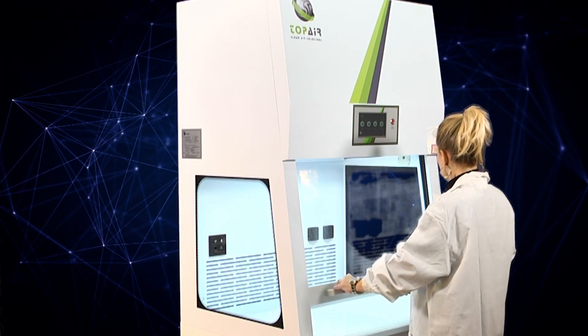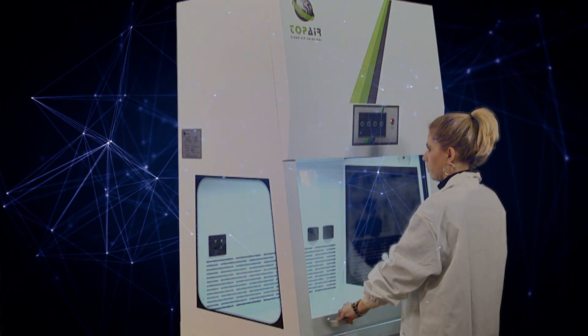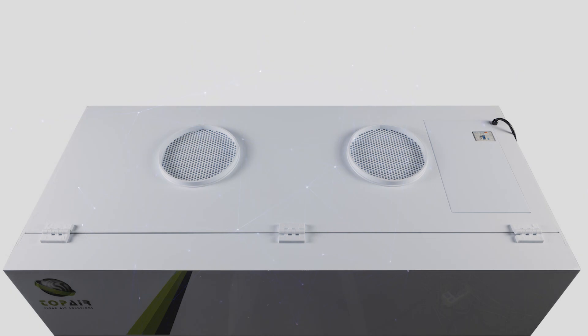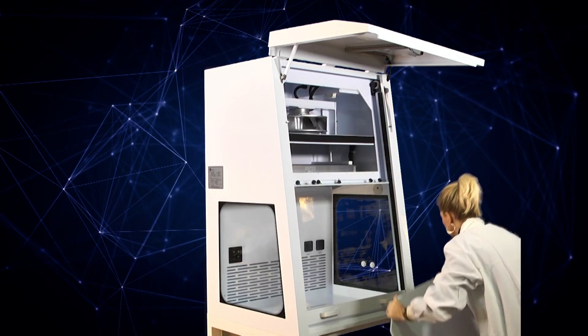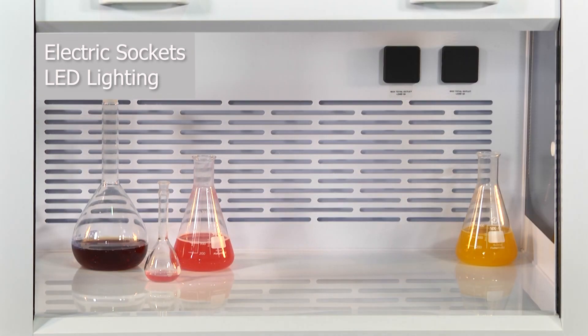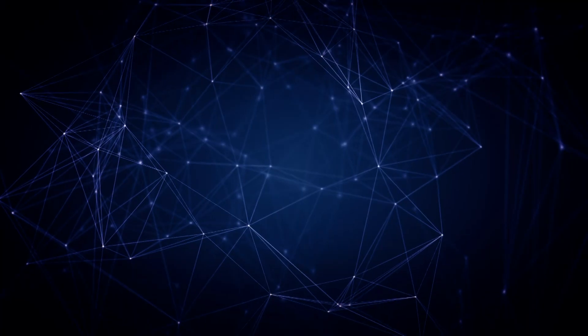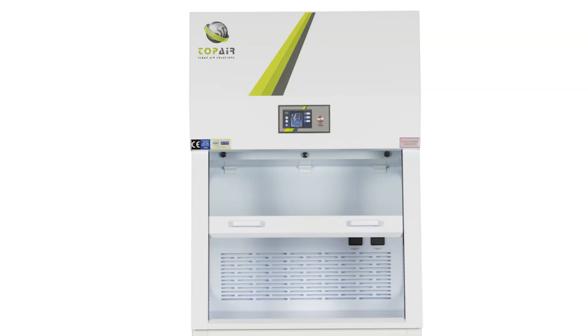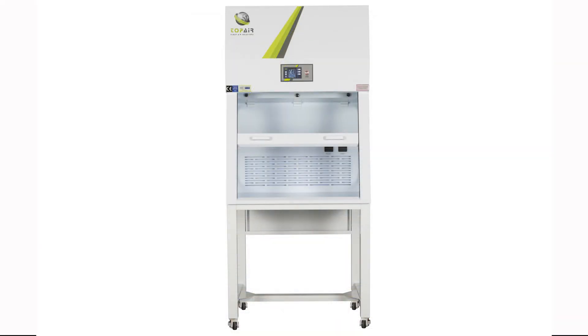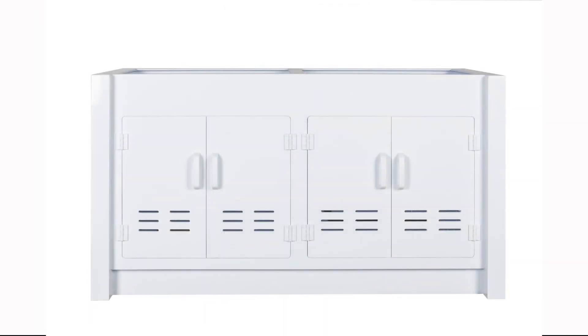All ductless fume hood models feature a sliding tempered glass front sash. The hood includes an EC fan and an exhaust point for connecting a second filter or external exhaust. A variety of filters are supported and can be easily replaced. Electric sockets and LED lighting are included. A plug-and-play product, it requires no installation. The hood can be ordered standalone, with a metal stand, or with a polypropylene storage cabinet.